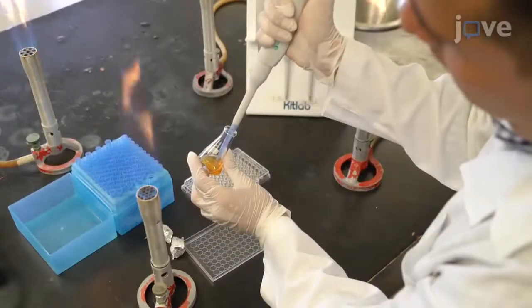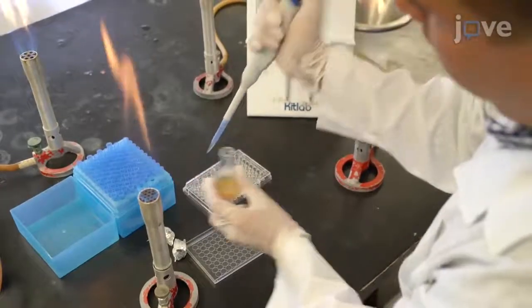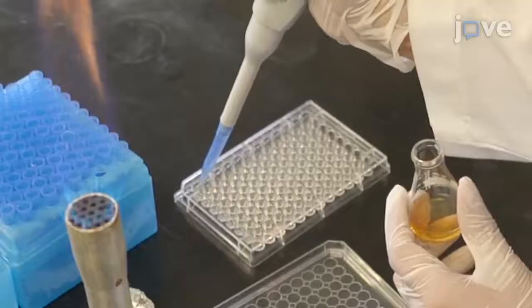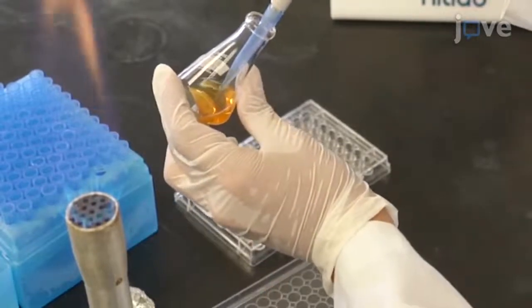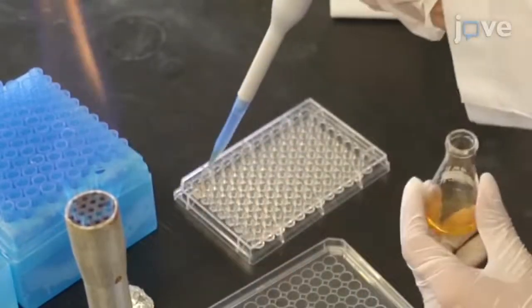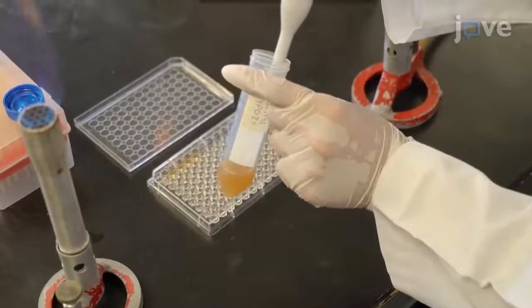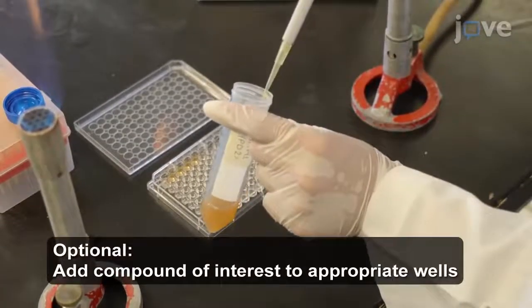For microplate growth curve setup, add 145 microliters of an appropriate experimental culture medium to each well of a sterile 10 by 10 well microplate with a lid, and inoculate each well with 5 microliters of the overnight culture.